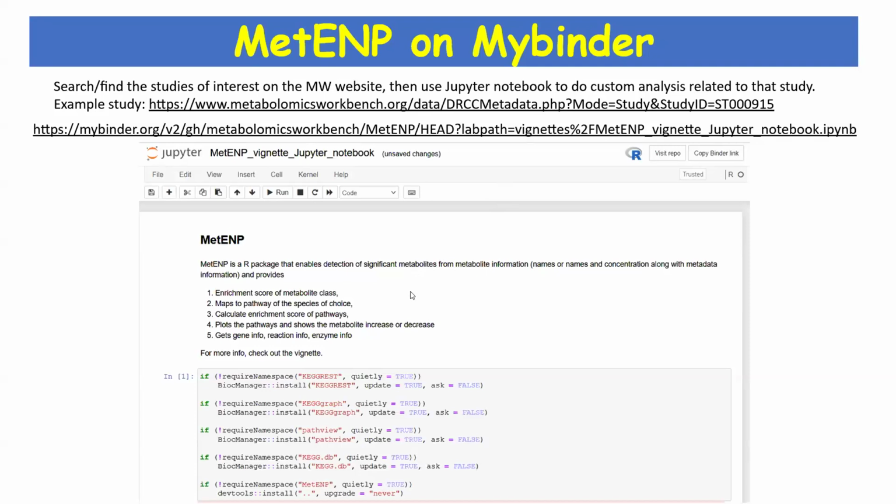Sometimes launching the notebook the first time can take a bit of time, because it might be trying to build the container based on the initial image. So if it shows any errors, just give it some time, and sometimes just restarting takes care of any issue.